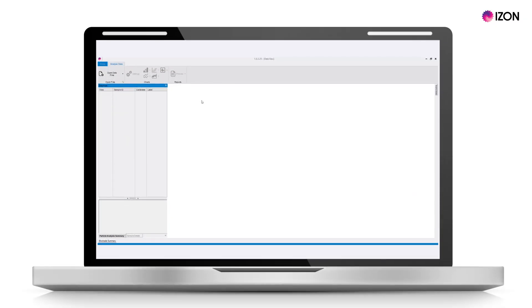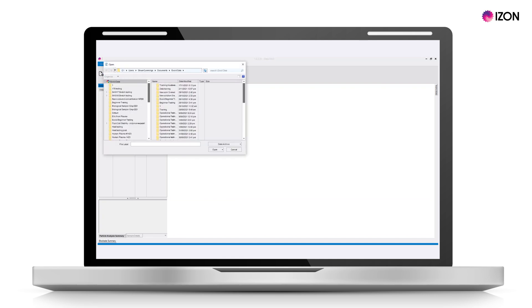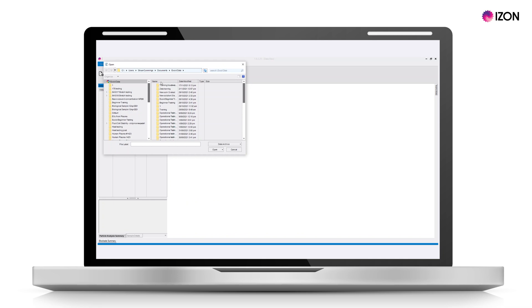Once you have collected a size and zeta measurement on your Exoid, open the Izon Data Suite, select 'Open Data Files', and navigate to your Exoid data file directory. This is located in your Documents folder by default.